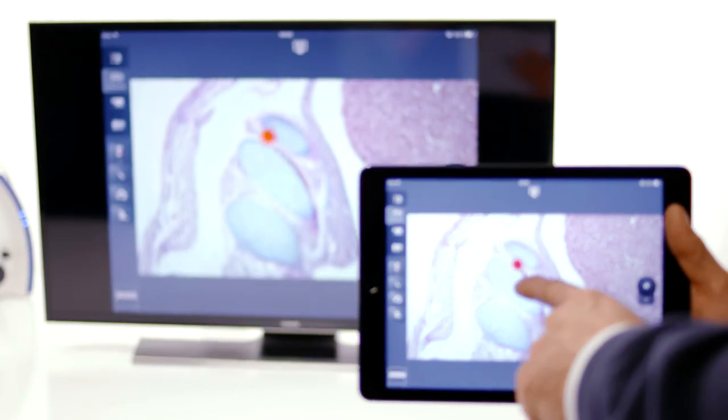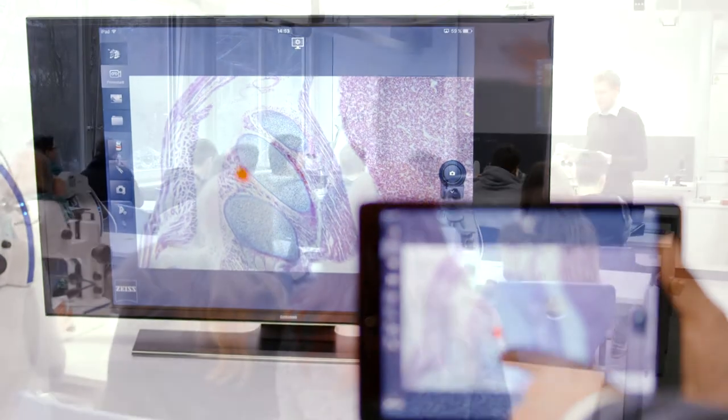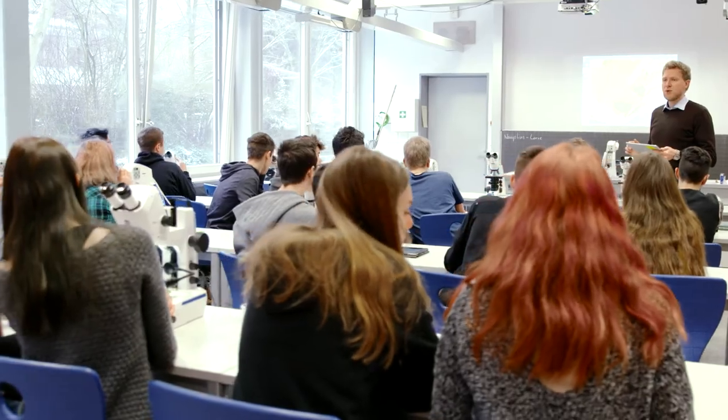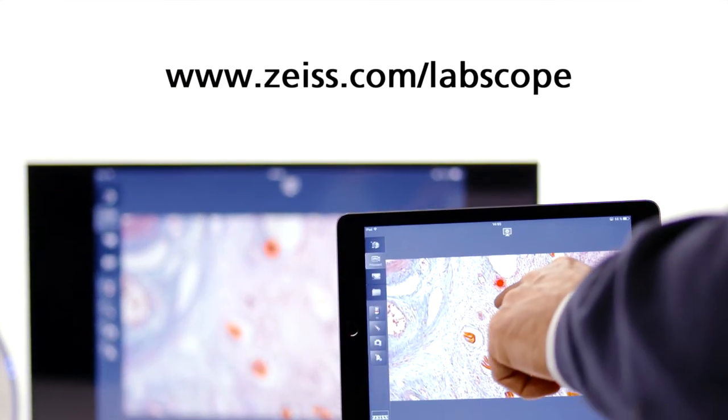It's never been easier to get your students' attention and share your findings with the whole class. For further information, visit our website.